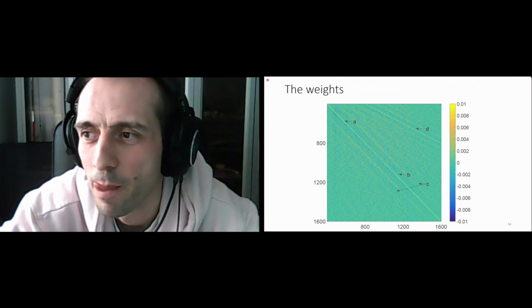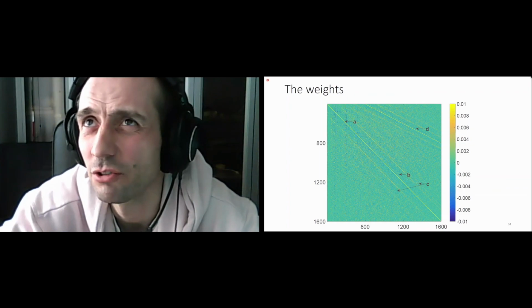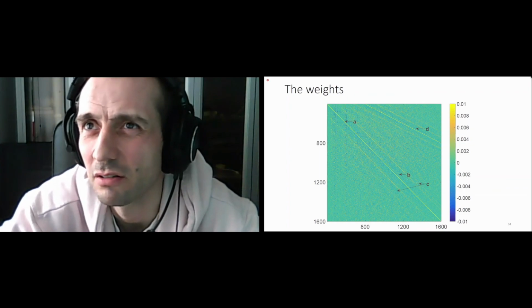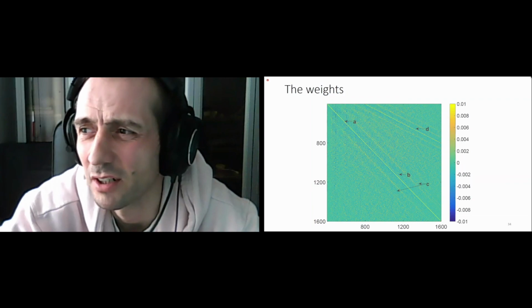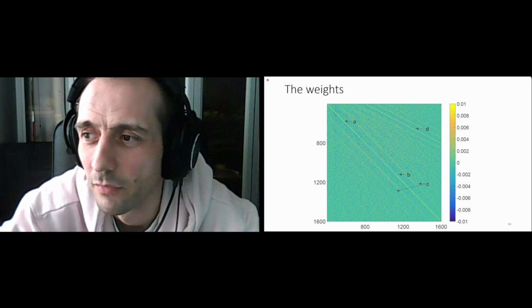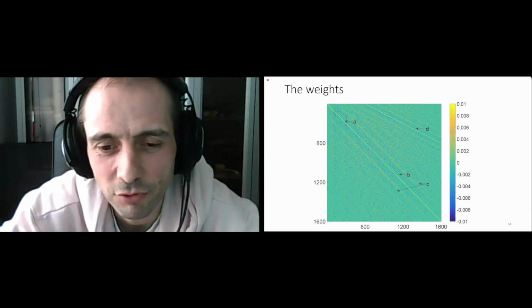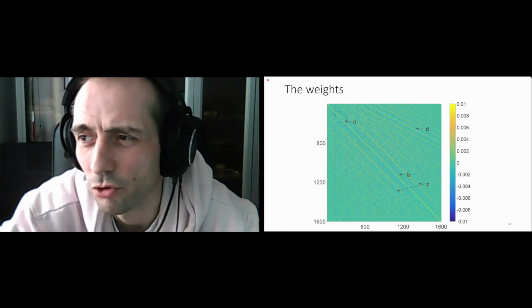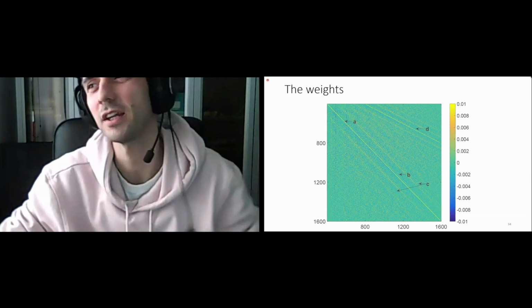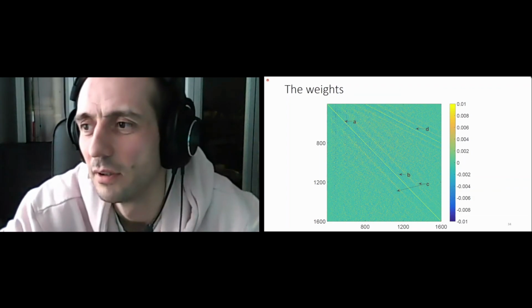But are you interested in high resolution, or is this enough for the application? No, for high resolution we needed like 100 gigabytes of memory, RAM, and that was trained on CPU. In our data sets, the whole training for one data set on a CPU for high resolution took 1 day. I think it was doable.